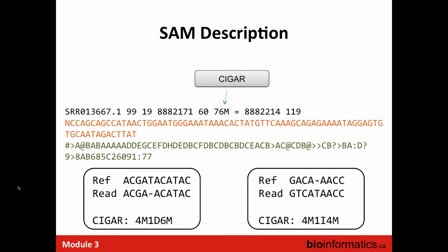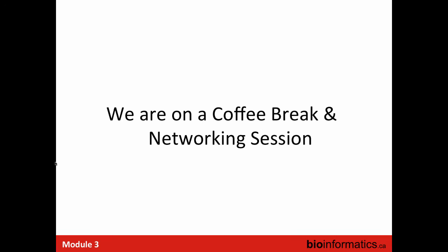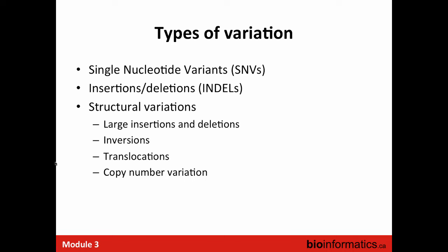Okay, if that's all the questions, let's move on to the exercise. Here's the second part of the module, which is covering genome rearrangements. I hope you all got on well with the read mapping exercise. So I'll give a brief lecture, probably only about 10, 15 minutes, about finding rearrangements. Then we'll do a second lab where you actually have a chance to run a rearrangement detector on the BAM file that you generated in the first part of the lab.